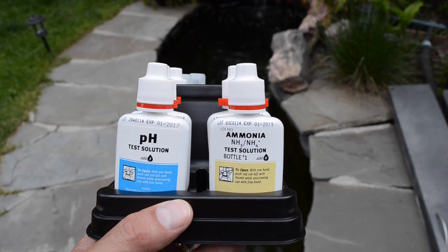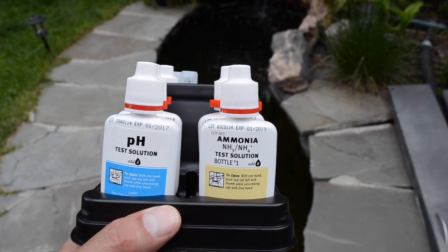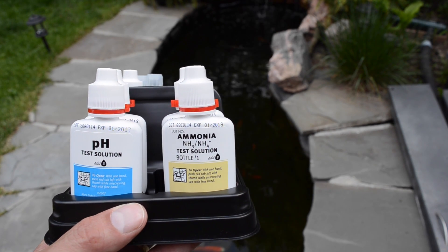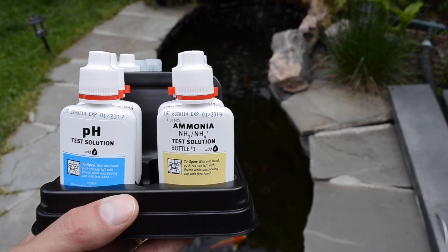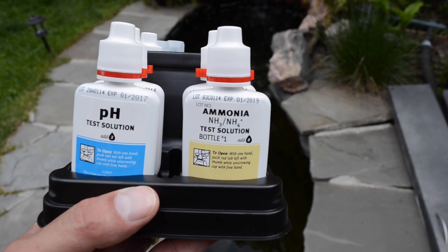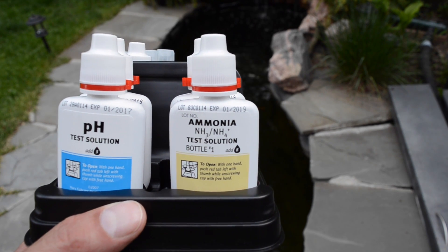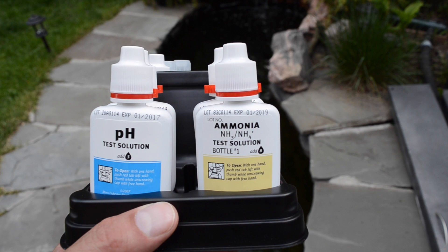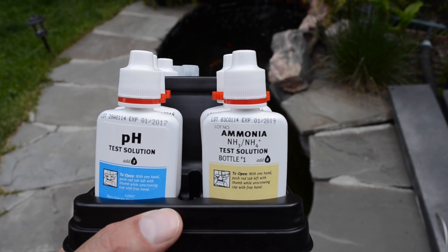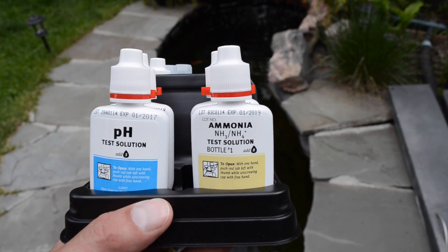The kit I have here is going to check pH, ammonia, and nitrate levels in the pond. The test is called the API Freshwater Test Kit — it's good for aquariums or outdoor ponds. So why do we test pH? pH is the measure of the acidity level of the water. A pH reading of 7 is considered neutral, higher than 7 is alkaline, and anything lower than 7 is considered acidic.